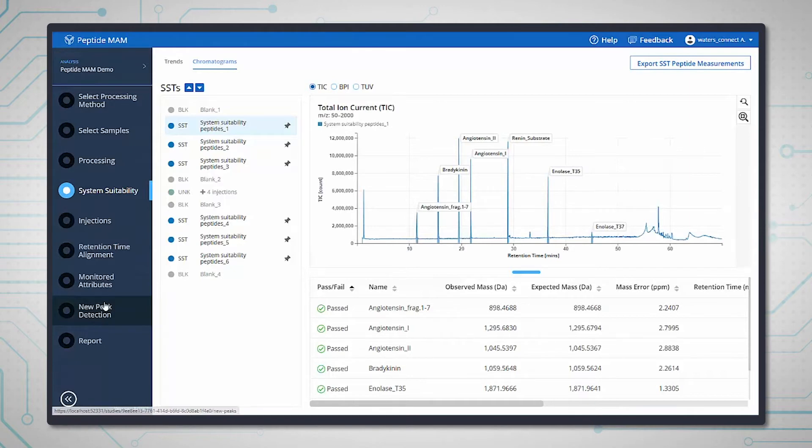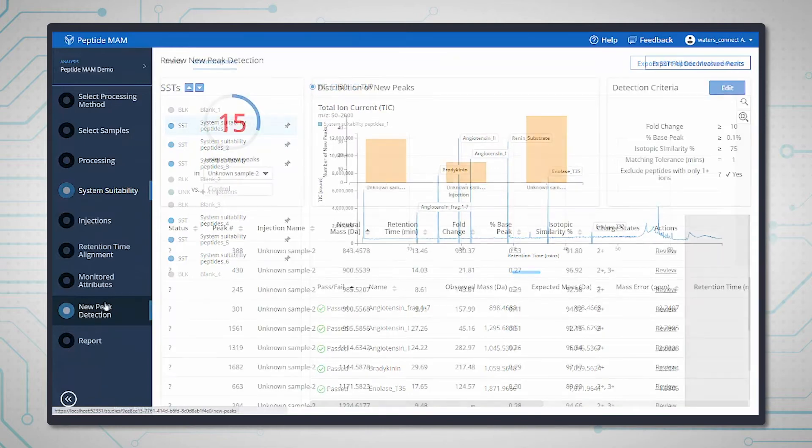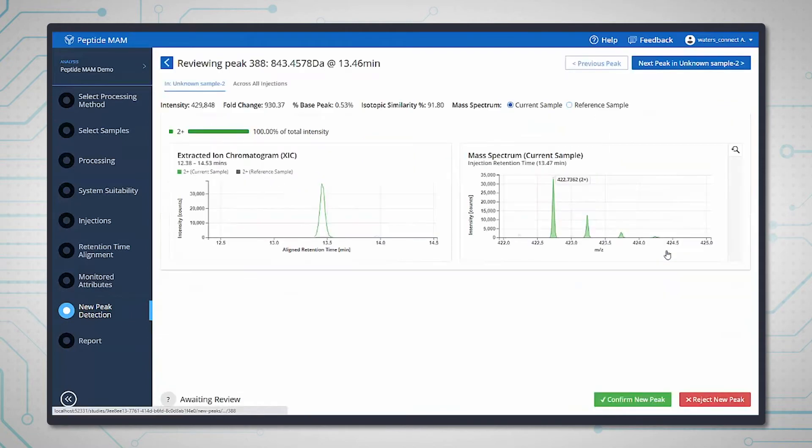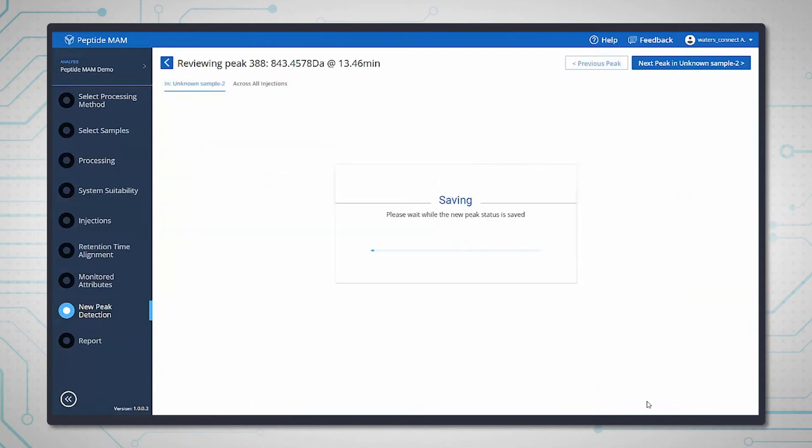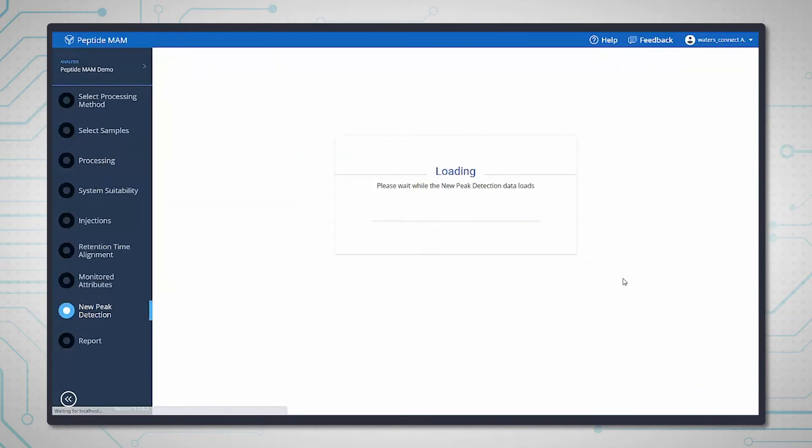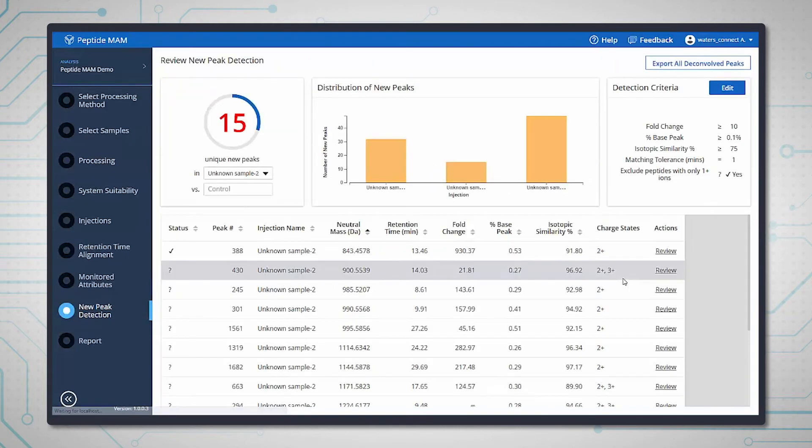As well as the ability to monitor specific attributes, the Peptide Man app also has the added functionality of new peak detection. This means that if any unknown sample in the analysis has a peptide that isn't in the control sample or is present in higher levels, it will be highlighted for review.